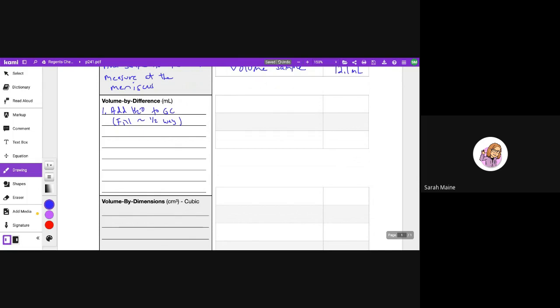No, but somewhere in the middle section of the graduated cylinder. Once you have placed water halfway up the cylinder, step two, you need to measure the volume of the water. And of course, record it.